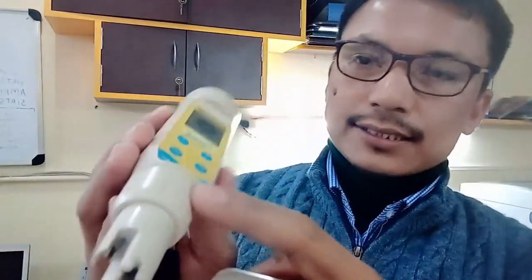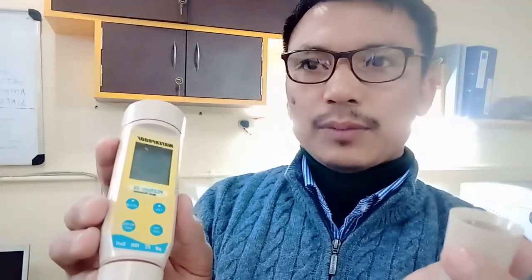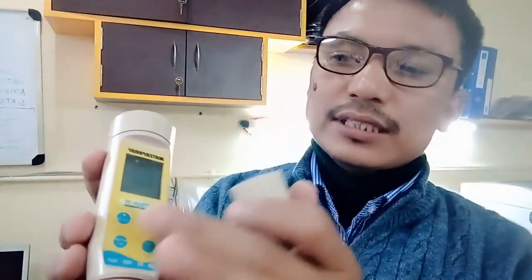Similarly, if you go for TDS, there is a mode section. This mode can be changed, and you can change the mode from pH to TDS. TDS means total dissolved solids, which are dissolved in the water, and many pollutants may be there. This will not tell you which pollutant is there, but it will give the level of those pollutants, whether they are in a very high amount or a low amount. This measure it will give you.